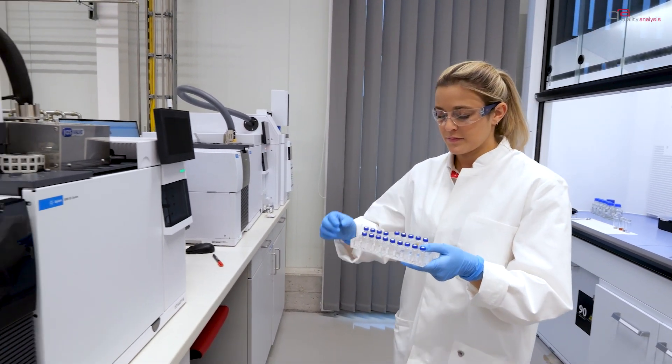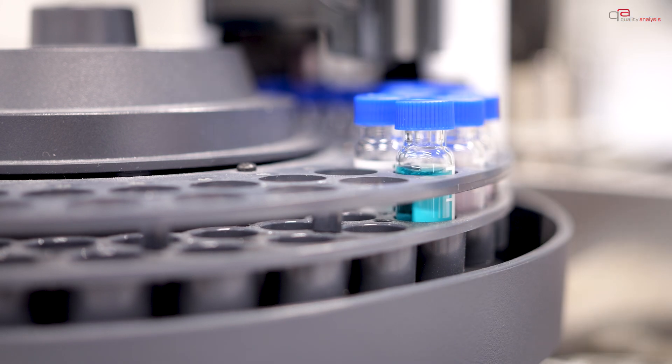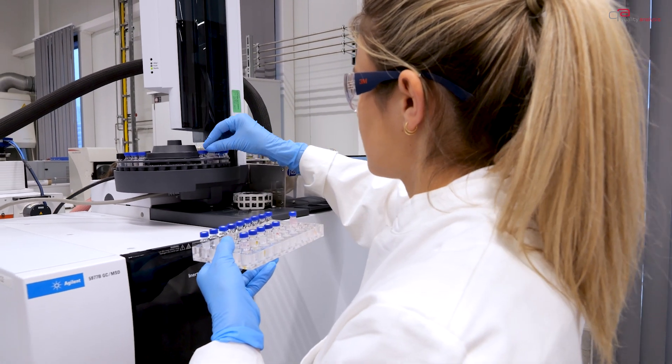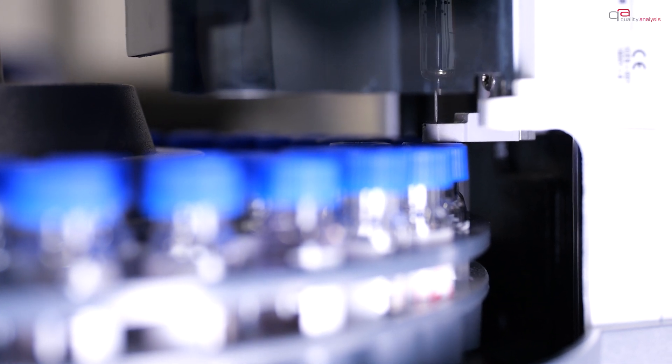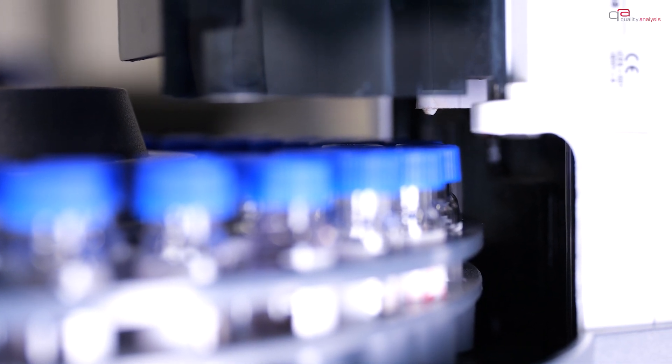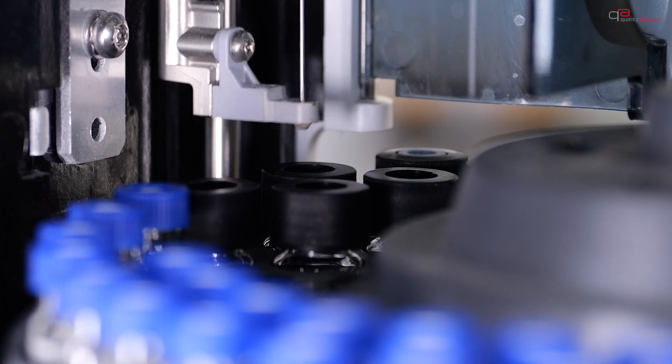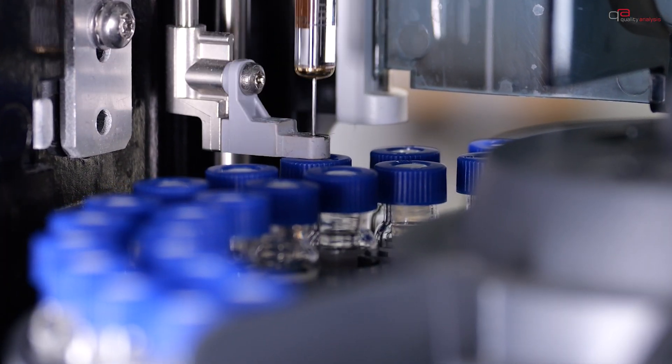The sample is introduced into the gas flow via the injector system. A syringe is used to inject the gas into the split-splitless injector. Here, the sample is vaporized and transferred by the carrier gas mobile phase, usually helium or hydrogen, to the separation column.